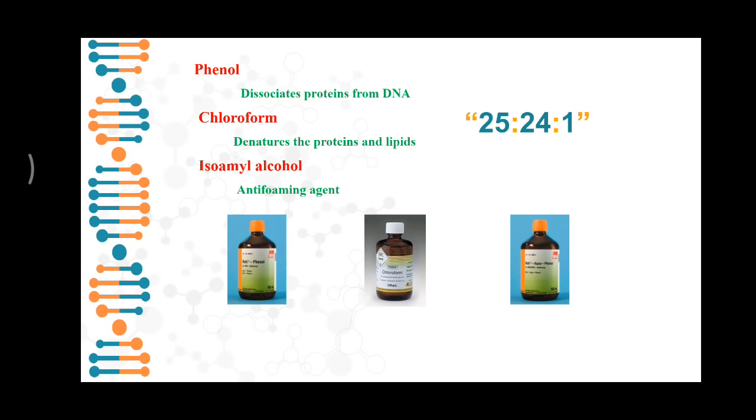In the purification step of DNA isolation, phenol, chloroform and isoamyl alcohol are regularly used. Mostly they will be used in a 25 to 24 to 1 formulation.